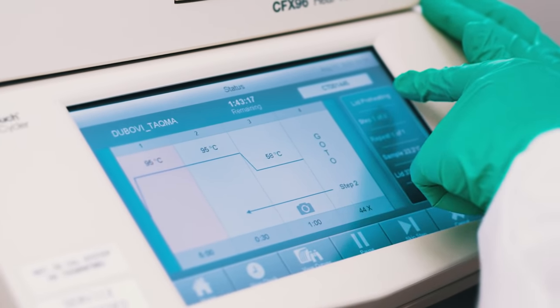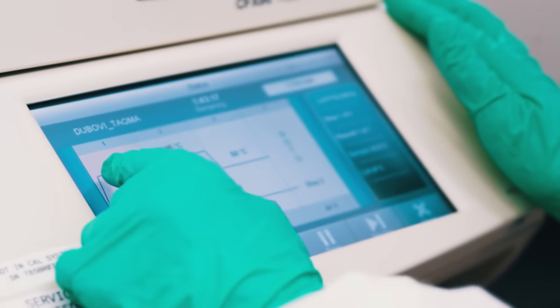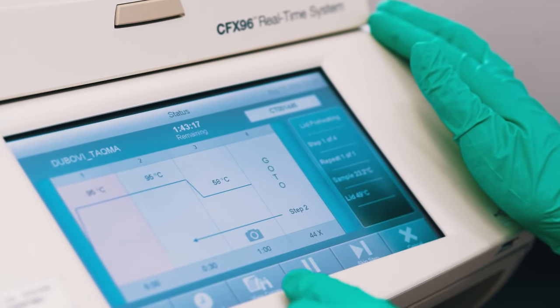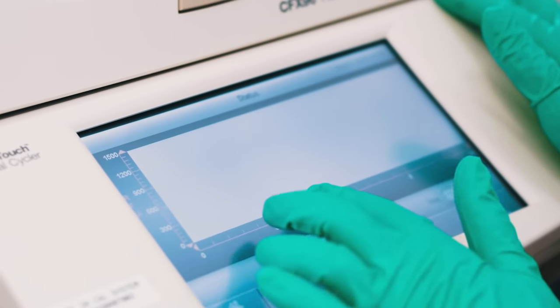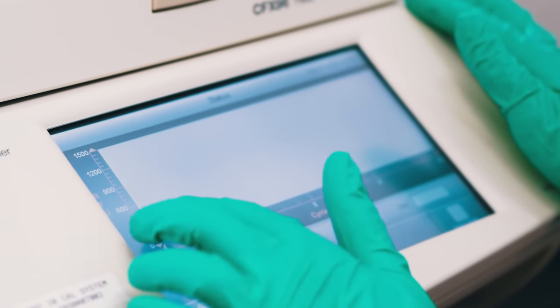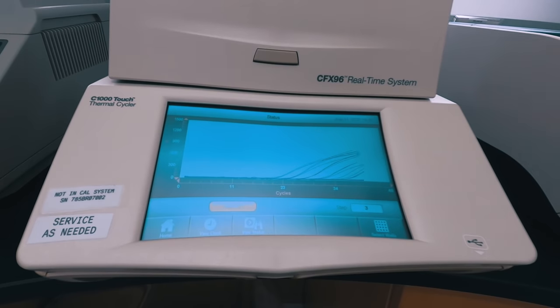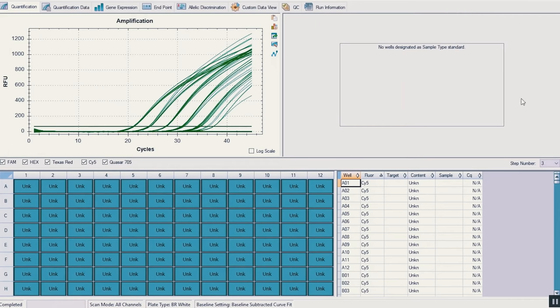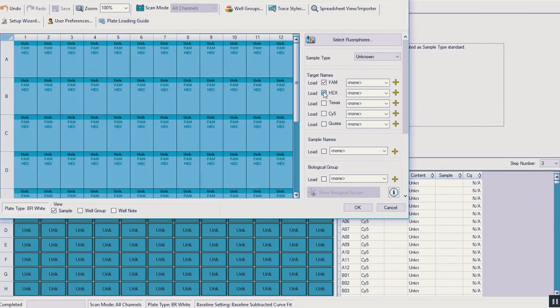OK, so the lid is preheating up to 105 degrees. Once it gets there, then the machine will start to heat the plate up to 95 degrees for its initial five minute denaturation. While this is happening, you can look at the graph. Right now there's nothing, but as the cycles progress, the fluorescence that is detected by the cameras will be recorded here, and you can actually see the curves develop over time. So here's our raw, unprocessed data, and we have four different views of the same data so that we can refer to different pieces of the information that we need quickly.